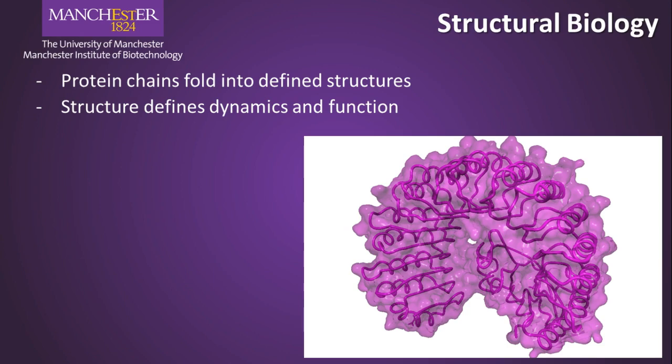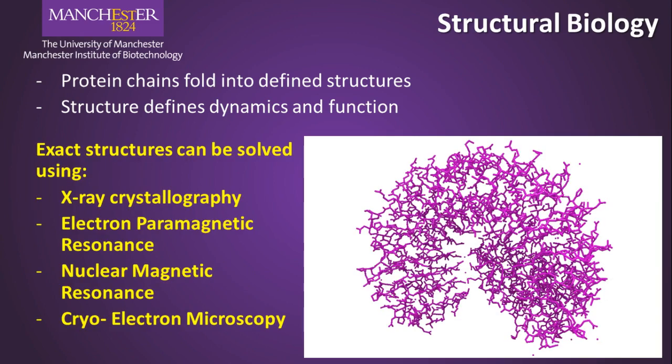This means that if the structure of an enzyme can be visualized, it is often easier to infer how the enzyme works and what could be done to manipulate the reaction, by changing the conditions in which catalysis takes place, or even by altering the protein itself. One common technique for performing such structure analyses is X-ray crystallography. This involves the crystallization of a pure protein sample into a regular pattern and diffracting X-rays through it to ascertain the average structure of all the proteins in the crystal.